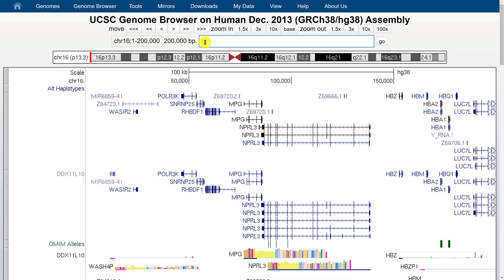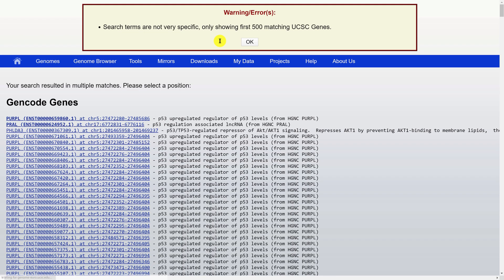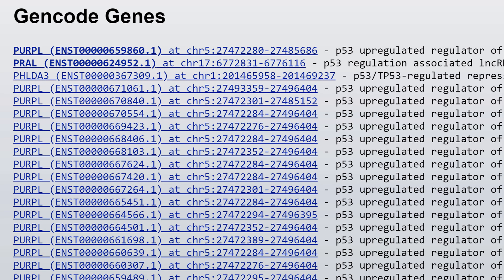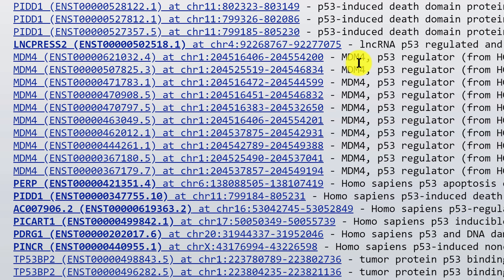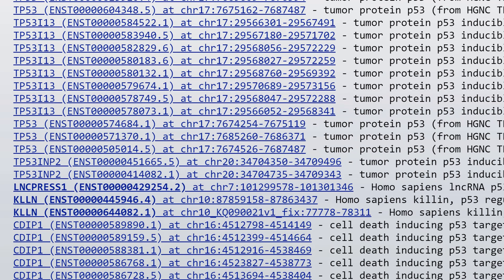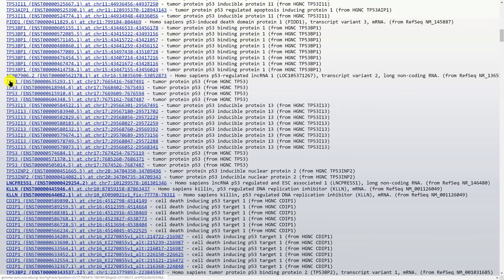If you don't know the coordinates, you can search by gene name, but it's important to know the official gene name. For example, if I put 'p53' in — a very common gene in cancer biology — nothing happens because it's not the official name. Clicking Enter does a search through the database, but it pulls up all genes, transcripts, and features associated with p53, of which there are very many. The actual official name is tp53.